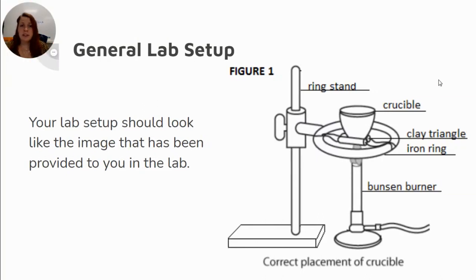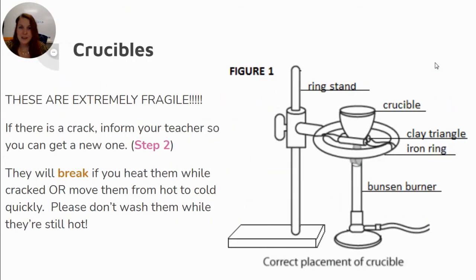So you do have an image of the general lab setup. It's important that you make sure everything is in its place. Get your ducks in a row before you start the lab, and make sure your setup looks just like this. It is one of the most complicated lab setups that we'll have this year, so make sure it looks the same as the image.